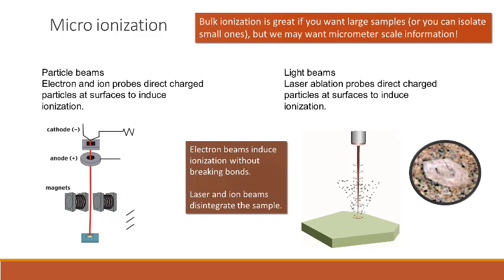Lasers, of course, are monochromatic light sources that appear in a near-focused beam. We're able to take that near-focused beam and concentrate it on a single point. With high enough energies, these can heat and liberate atoms from a sample, as shown in the cartoon. As you might imagine, these techniques are useful for analyzing individual spots on mineral grains.